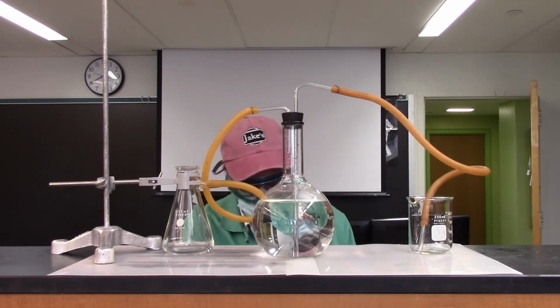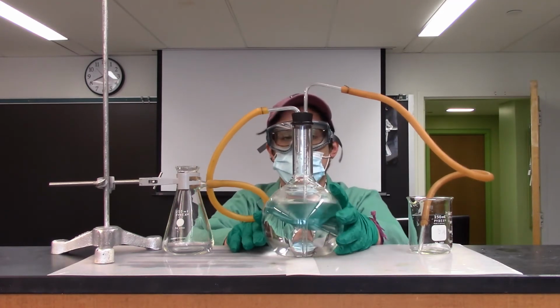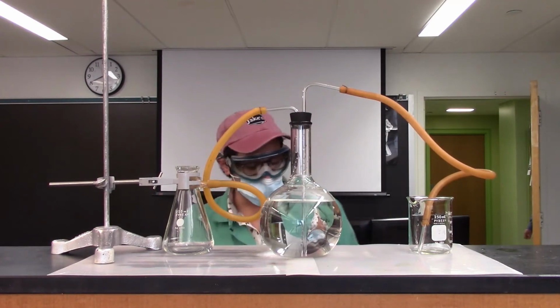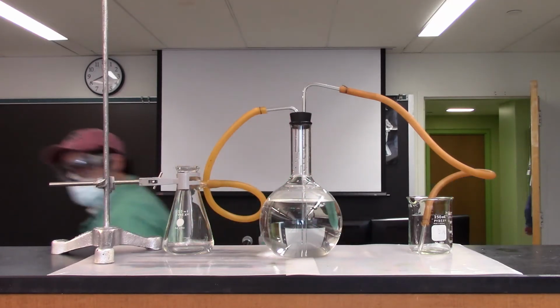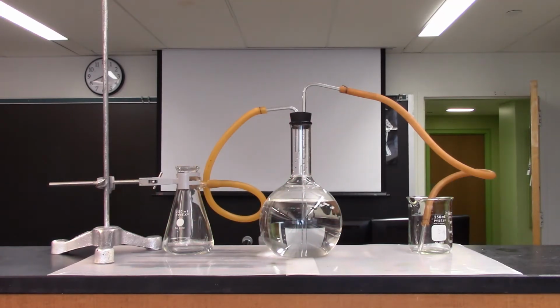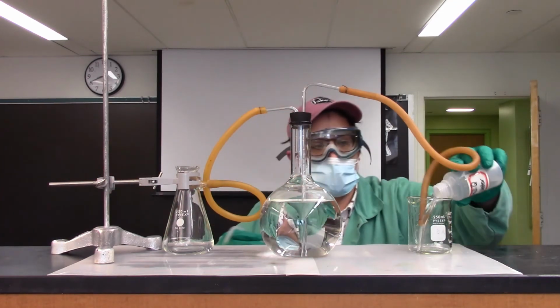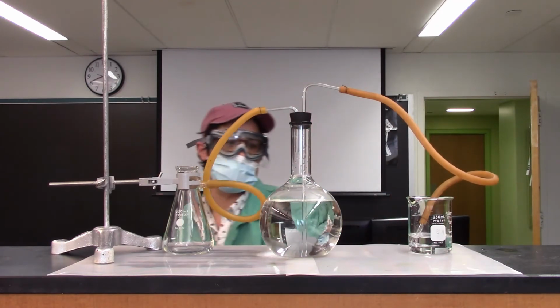So what we're going to do now is set this up so we can purge this system completely of air bubbles. So what I'm going to do is grab some distilled water, and I'm going to fill up this beaker with some so I can see that I've purged all of the air out.